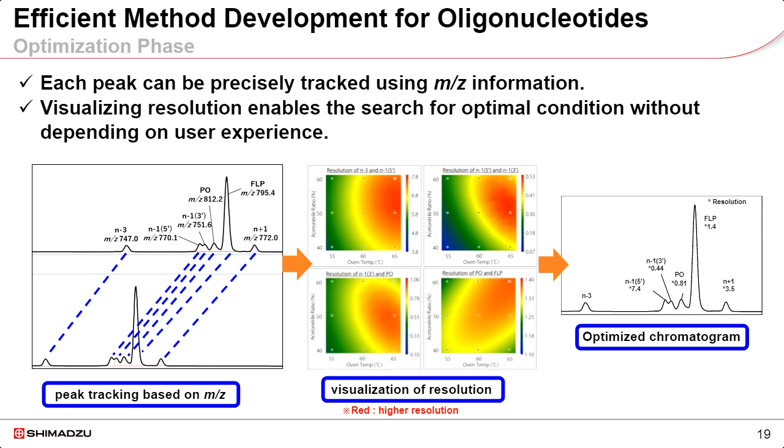Looking further into the subject of oligonucleotides, we see that LabSolutions MD and its incorporation of peak tracking along with single quad mass spec can be particularly useful when trying to do impurity analysis or preparing analytical methods that will detect small level impurities in specialized synthetic oligonucleotides. Given the close relationship to the target compound, being small variations or substitutions, it's oftentimes a very challenging separation to get apart some of those minor component impurities.